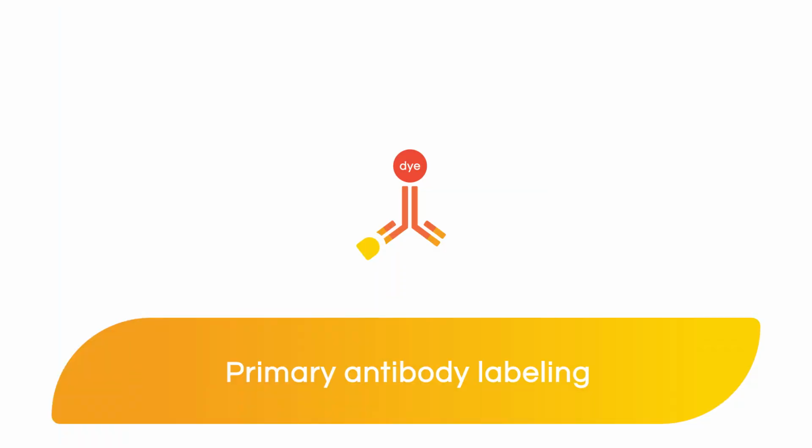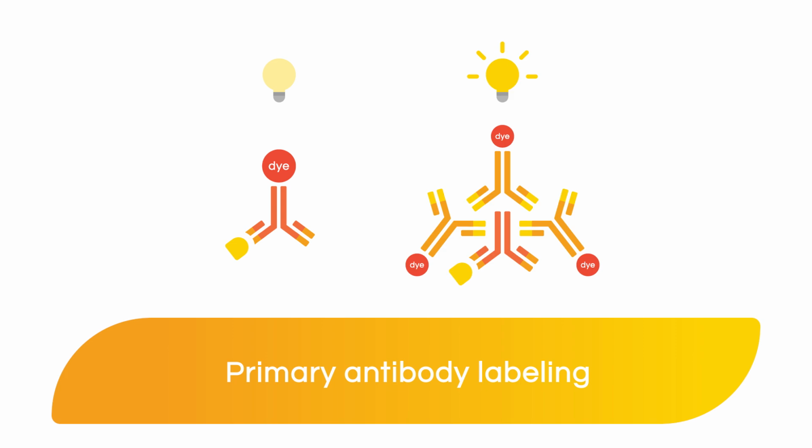In some cases, you may not be able to find some primary antibodies that you can multiplex together, perhaps because they were produced on the same host species. If that is the case, you may want to consider labeling your primary antibody. When you label your primary antibody, you will typically end up with less nonspecific background and with a shorter protocol because you're actually skipping the secondary antibody incubation step. However, exactly because you're skipping that step, you will also avoid having the signal amplification that is generated by the use of the secondary antibody. So use caution when you know or you expect to have low signal.